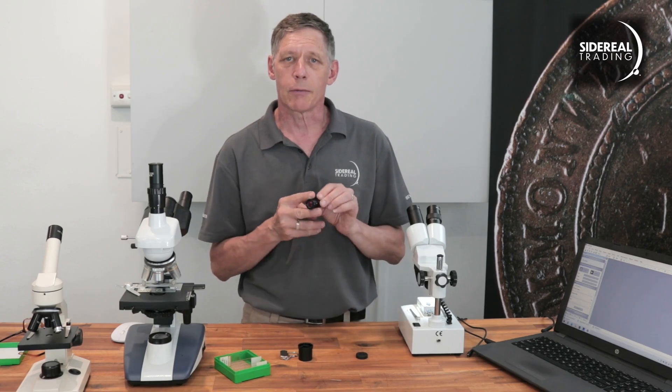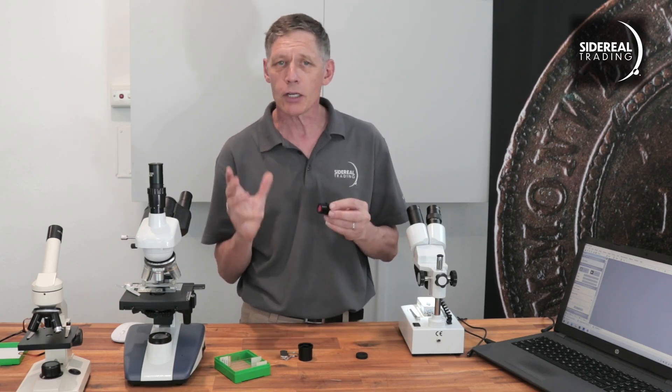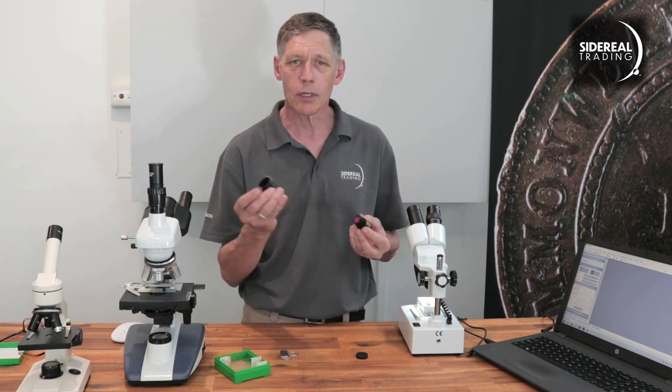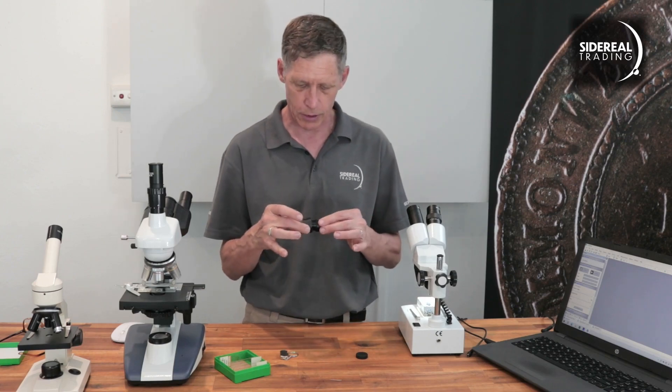Here's the part that goes in the eyepiece holder — it's 23.2 millimeters wide. If your microscope has got eyepieces larger than this, you're going to need an adapter like this one. I'll be needing this adapter for one of my microscopes, and it just goes in like that.